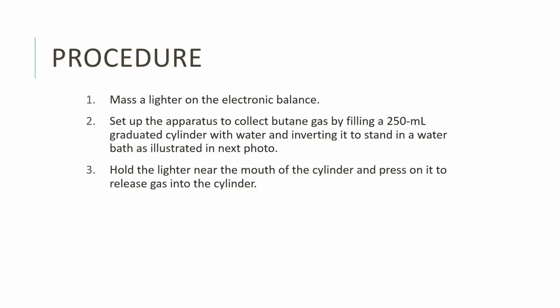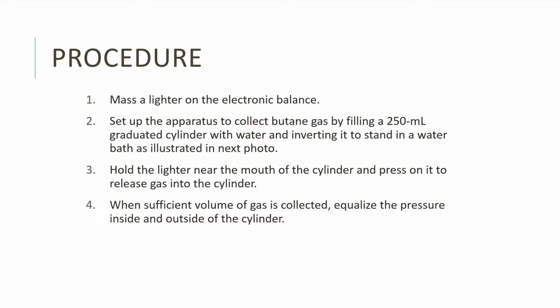Then, take the lighter and place it in the mouth of the cylinder and press on it to release the gas into the cylinder. Make sure that all of the gas is being collected in the cylinder and none of it is being released outside of the cylinder.